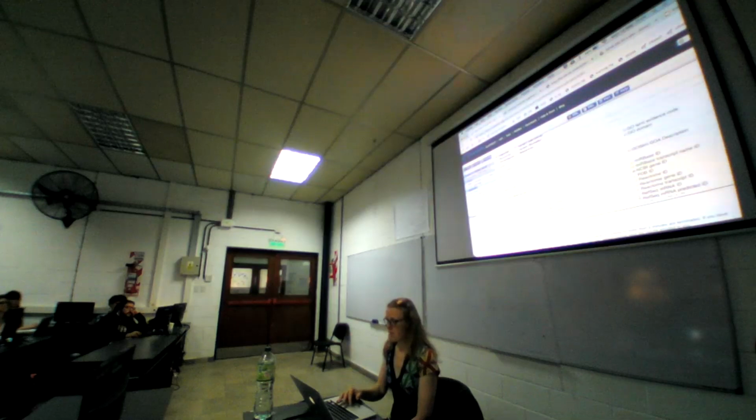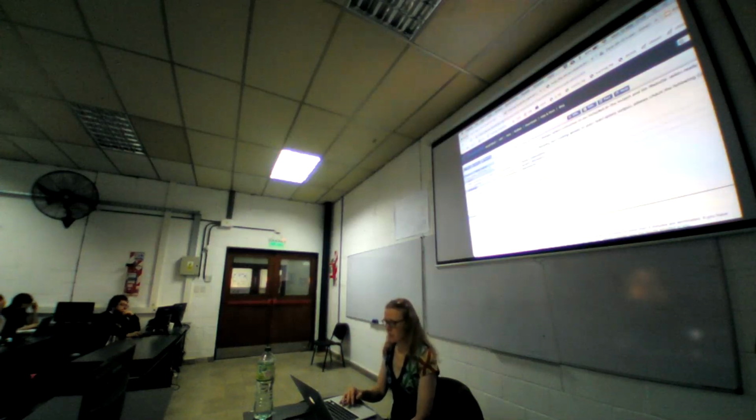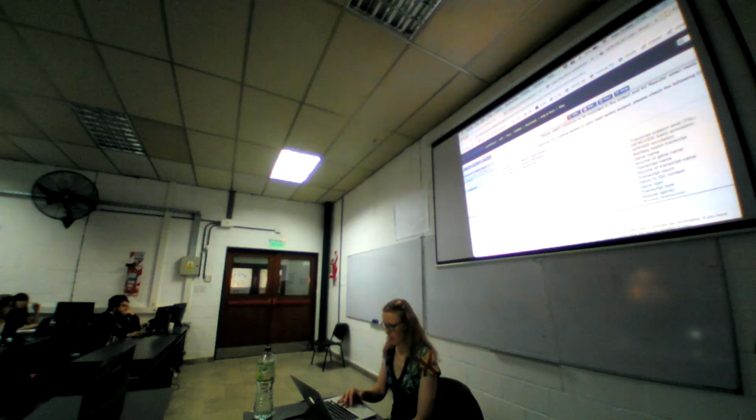You can see everything that I've selected on the left-hand side, plus gene stable ID and transcript stable ID, which are already pre-selected. I will add my gene names to those as well. So I'll go into gene, and I will add gene names here. And now I can do a final check on the left if I have everything, and just click on results.